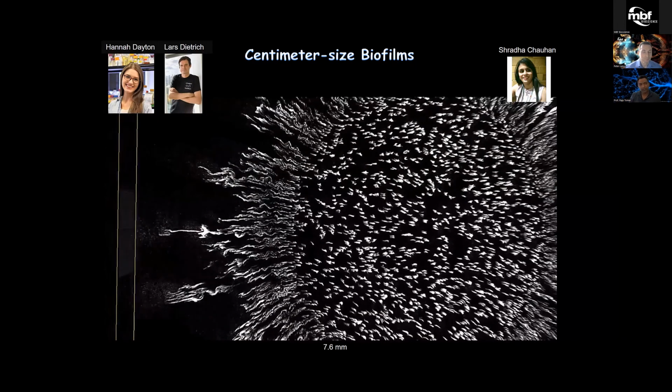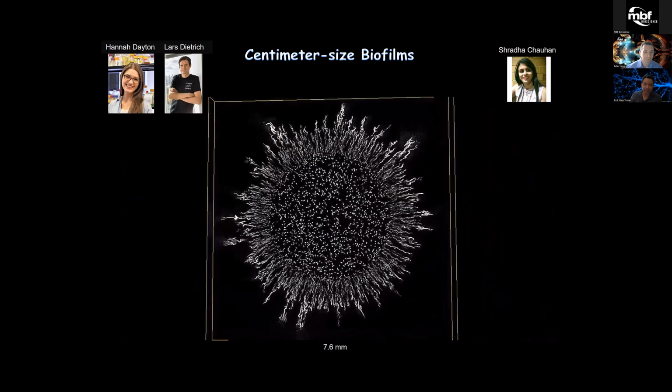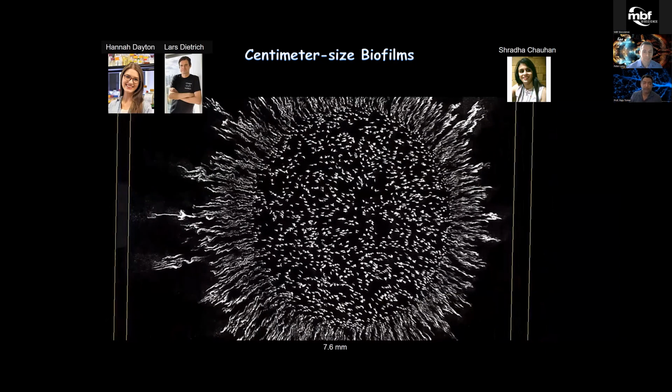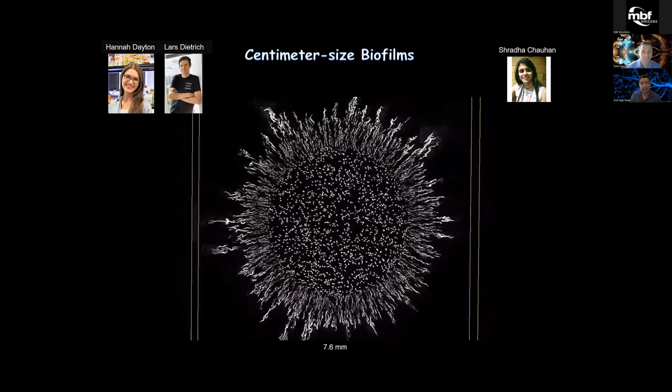So beyond neuroscience application, and of course, various different organs that can be cleared, or biopsies from clinical world can be imaged at high resolution and high speed.